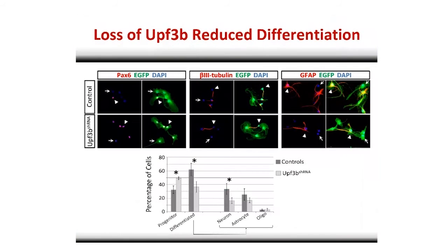And for that, as I mentioned, we plate the cells out, we let them differentiate over a few days, and then we can use marker genes to stain the cultures. PAX6 stains for neural progenitor cells, beta-3 tubulin stands for early born neurons, and GFAP stands for the astrocytes, and we really just conduct cell counts to see where there was a difference in the kinetics or composition of these cultures.